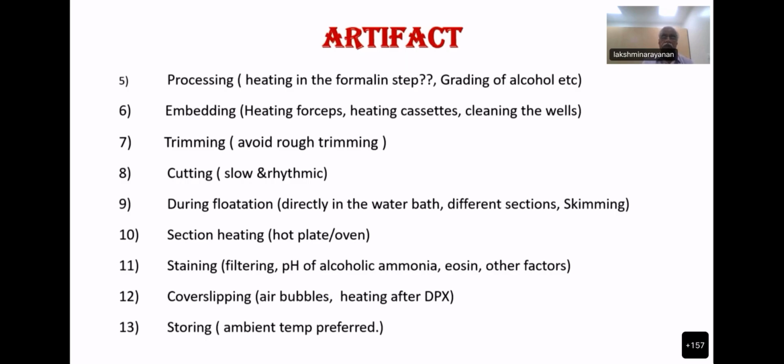Then while talking about the trimming, avoid rough trimming. When I mention avoid rough trimming, how many people have seen the seniors also cutting microtomy, I don't know. People cut, they also shake, their table also shakes, that much faster they do. That is very wrong. The cutting and trimming should be done in a slow and rhythmic manner. Then only the sections will come. When you trim in a very rough way, then after the trimming you just cut, there will be many holes in this.